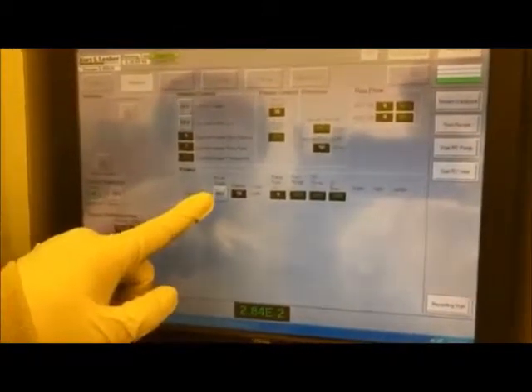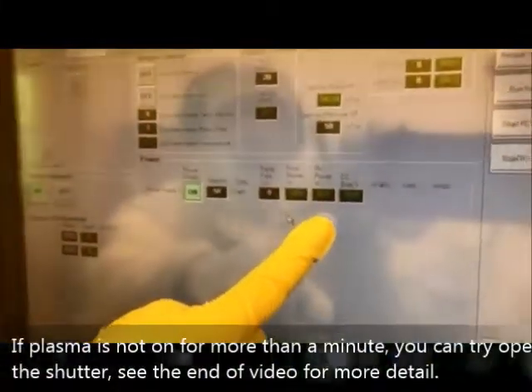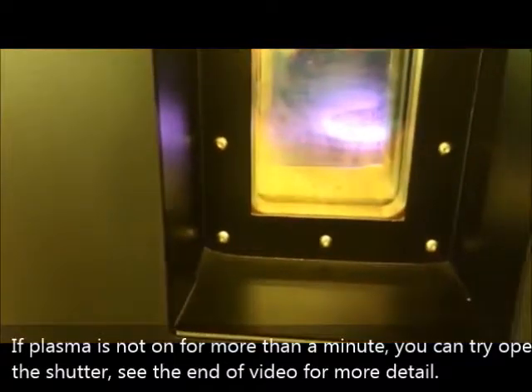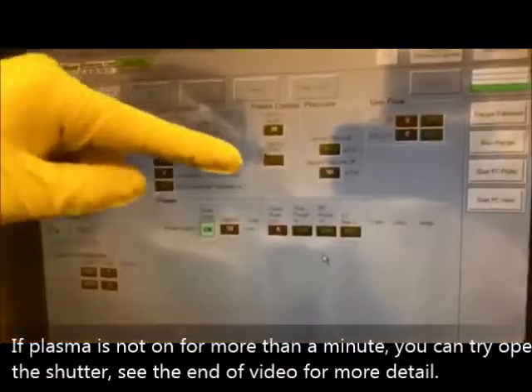Once we kick it on, we will look at the window to make sure the plasma is on. So I'm going to turn this on. You can see the forward power is 40, and reverse power starts dropping. And we are waiting. Now the plasma just ignited. Once the plasma is ignited, we are going to gradually bring down the pressure.